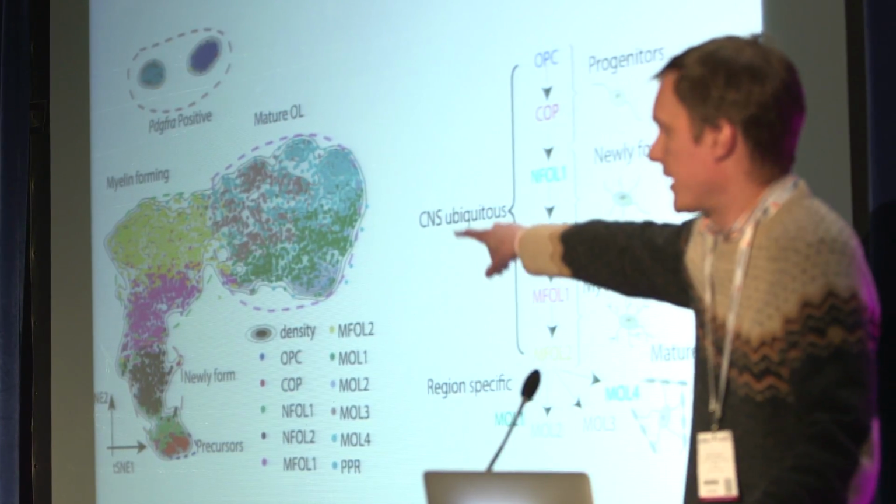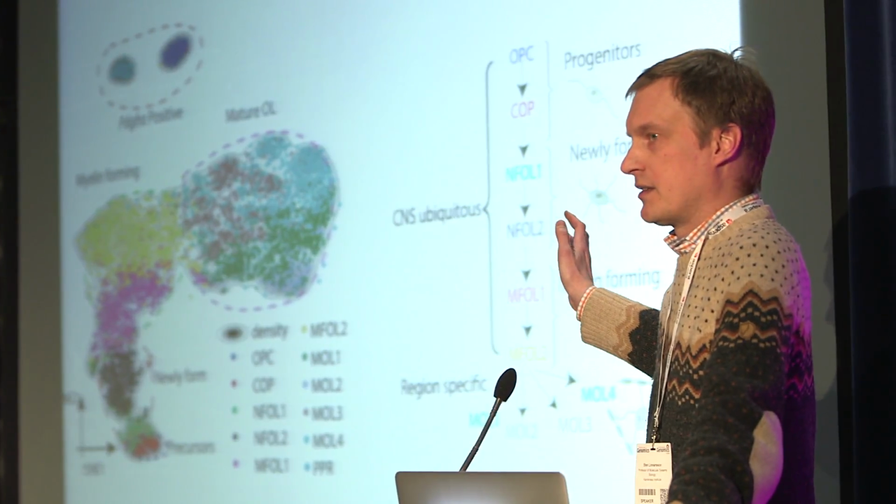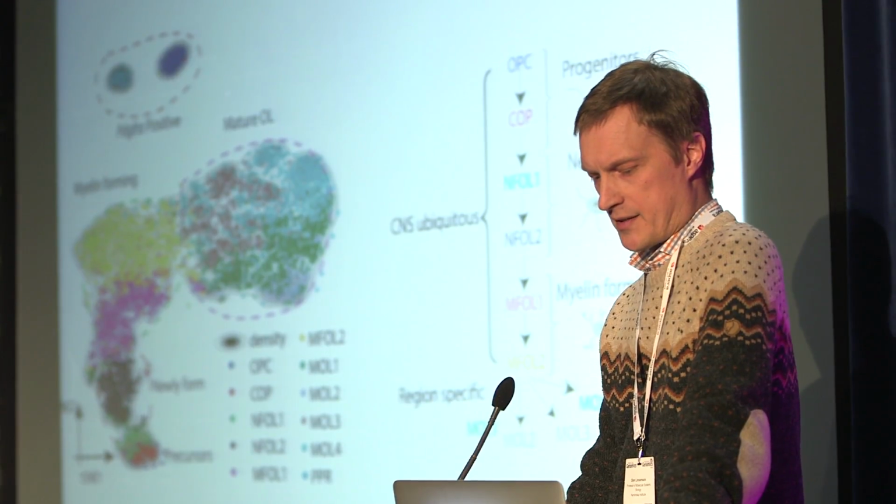Now, any child can draw a line through this and project all the cells to that line, and you can get pseudotime out of this. It's so densely sampled that it's actually a trivial problem in that sense.